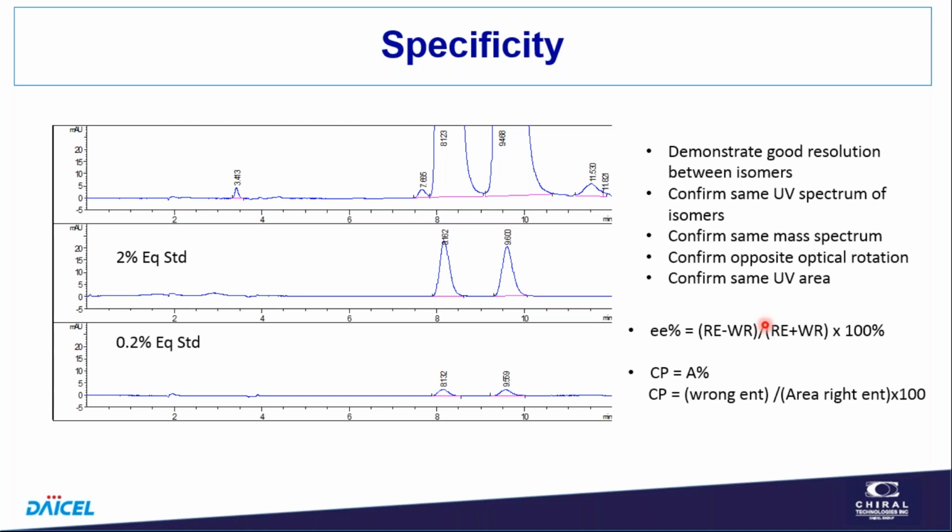I don't want to get into this, but there's something about enantiomeric excess, and sometimes people report the results in chiral separations in enantiomeric excess, and it's archaic, but it's not wrong. It's an acceptable way to do it. I think it's unnecessary, and it's just confusing, but the transformation between enantiomeric excess and chiral purity is doable. We use the same numbers. We look at the difference between the desired enantiomer, or right enantiomer, and the wrong enantiomer, divided by the sum of the two enantiomers times 100%.